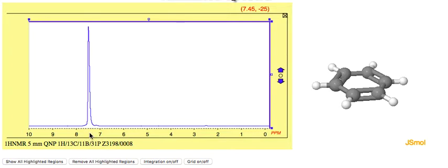And then you look at the NMR and you see, oh, look at that out here in the 7 to 8 range, that sort of range. You're going to say, oh, there's a benzene ring in this molecule.